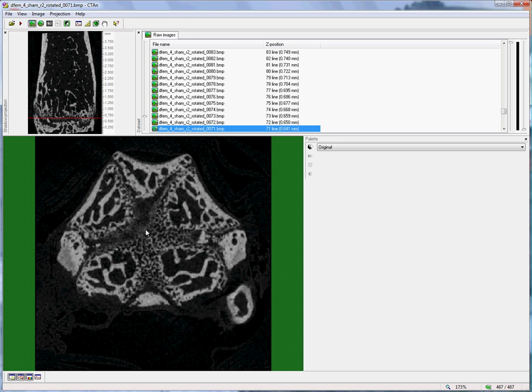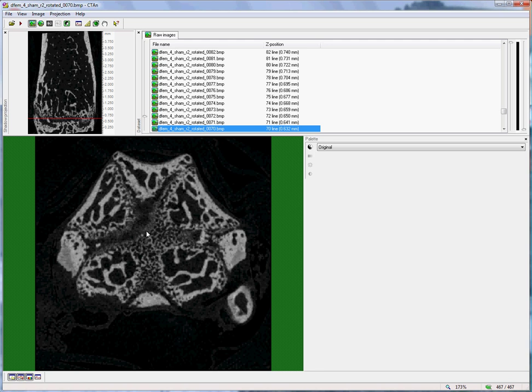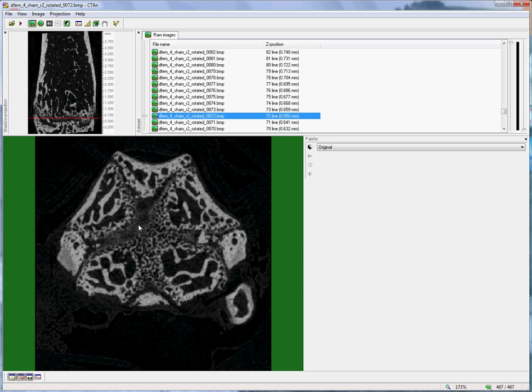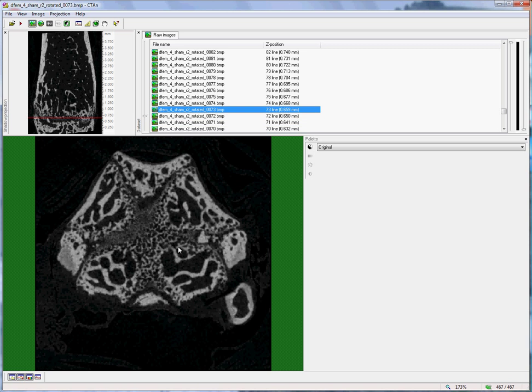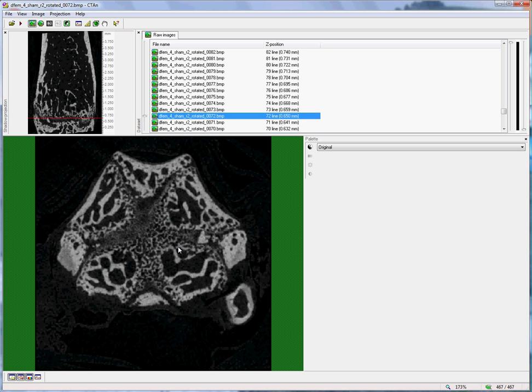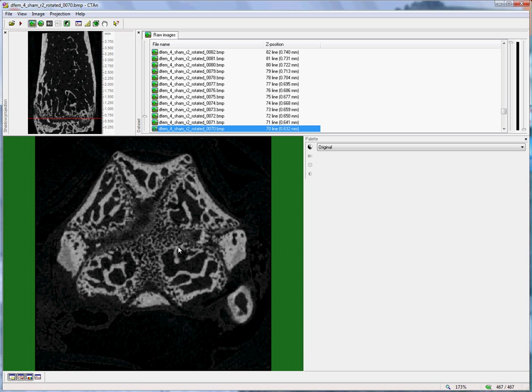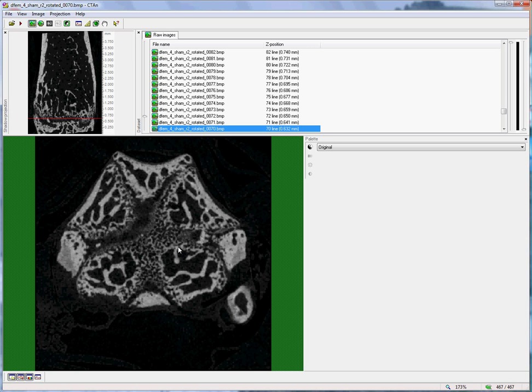there comes a point here where that bridge is continuously established. One or two slices away and the bridge is interrupted. So this criteria allows a reasonably accurate identification of a single reference slice at the growth plate.